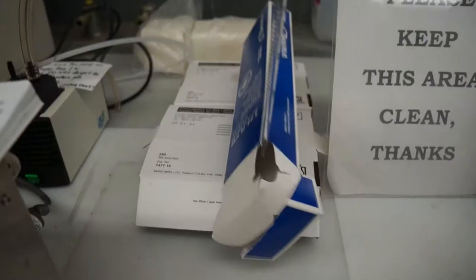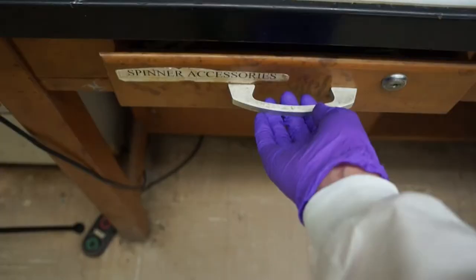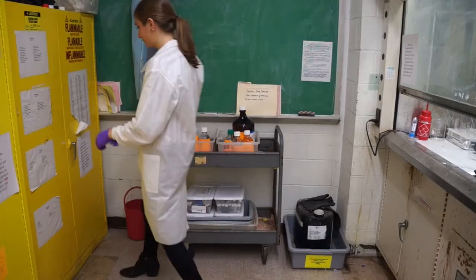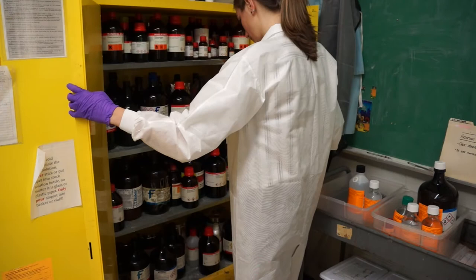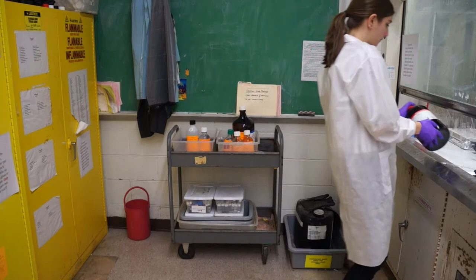With a glass pipette, a glass beaker, and a pipette bulb, we can measure out our 20 milliliters of toluene. You can find the stock toluene bottle inside the safety cabinet. When taking out bottles from safety cabinets and putting them back in, you should always close the doors in between those steps. This way if a fire occurs outside of the cabinet, then the hazardous chemicals inside will be protected.